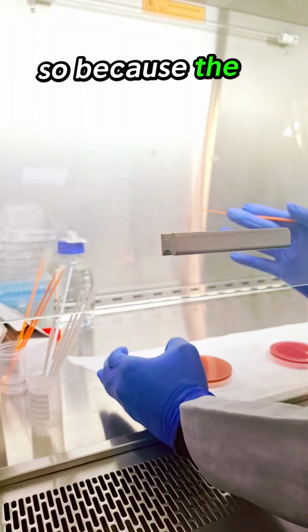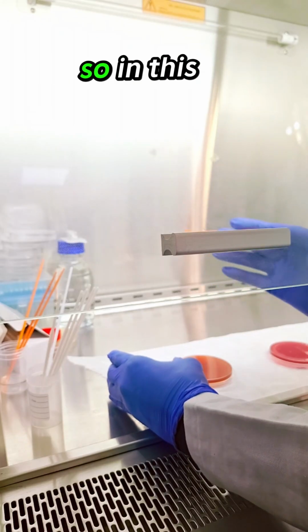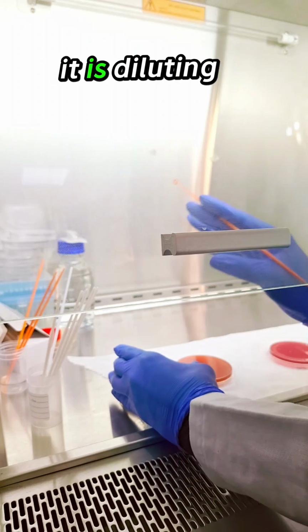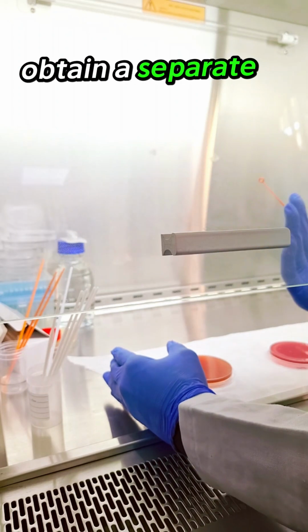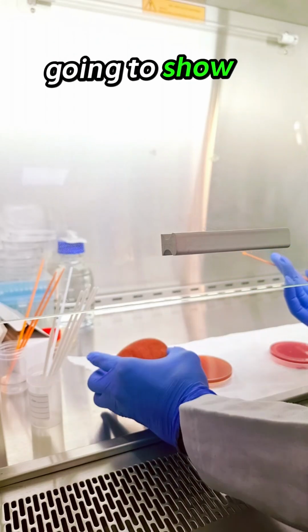The quadrant method makes 4 quadrants. As we are going down to the last quadrant, it is diluting the bacteria. These are mixed cultures, and of course, you obtain separate pure colonies. So I'm going to show you how we are going to do it.